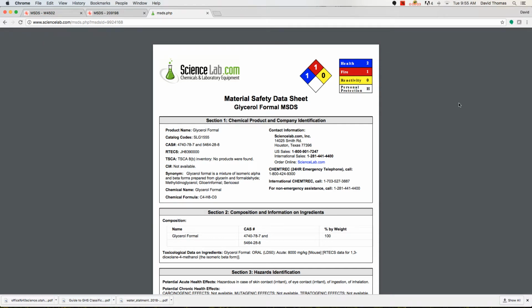Welcome. This video is designed as a brief introduction to the documentation that outlines the hazards associated with the various substances you'll be working with in your laboratory course. A document such as this that covers the hazards associated with a particular substance is referred to as an SDS, or Safety Data Sheet. Now, many people still use the term MSDS, which is an older term standing for Materials Safety Data Sheet, but refers to the same thing.